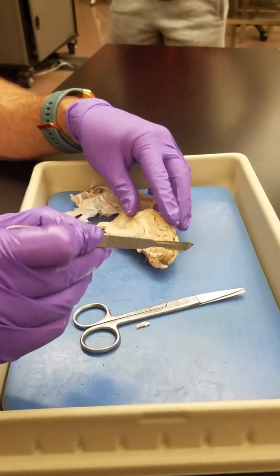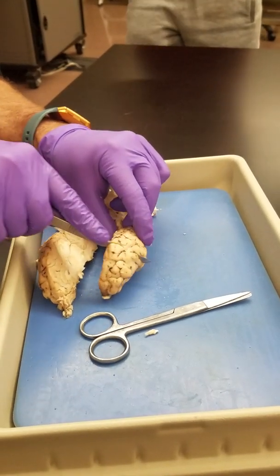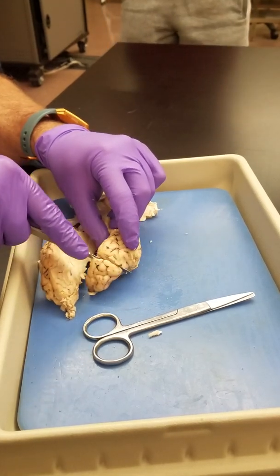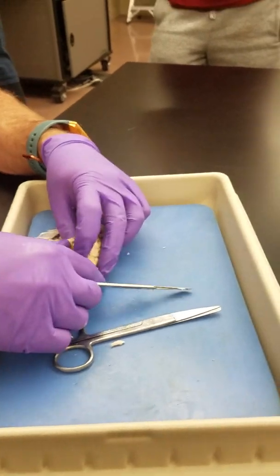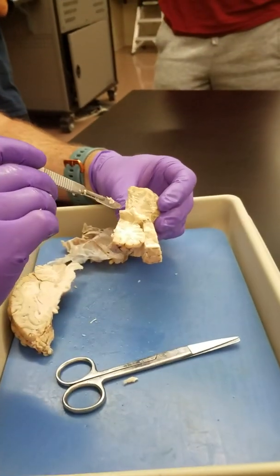Okay. If I were to cut this open here, see how it's different colored, right? So there's some pink stuff going on in here.